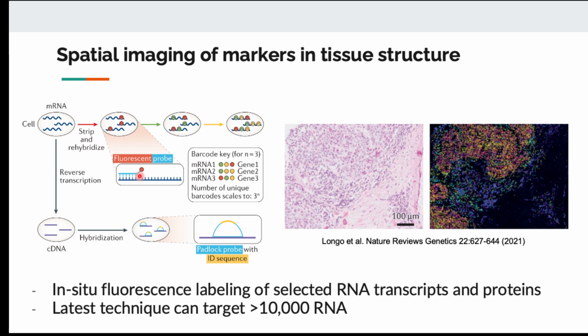But in nanostring, what they try to do is create a barcode of fluorescent signals. Green, red, green, blue, blue. Each one being linked to one gene, so that you can visualize different genes at the same time. But the limitation of nanostring is that you can only have so many combinations of fluorescence on the same probe.